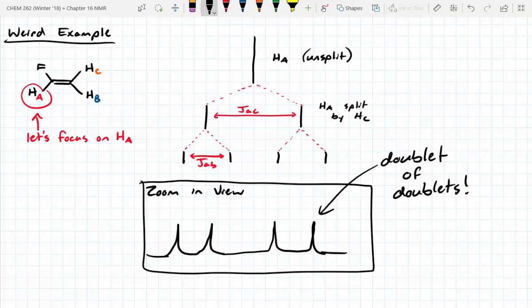This typically only shows up in a meaningful way with alkenes. You can clearly see the splitting pattern with alkenes. Otherwise, people just call them multiplets, meaning if they're coming off an aliphatic system, the splitting is so close to the same magnitude, they overlap a lot, and you just get these confusing looking peaks called multiplets.